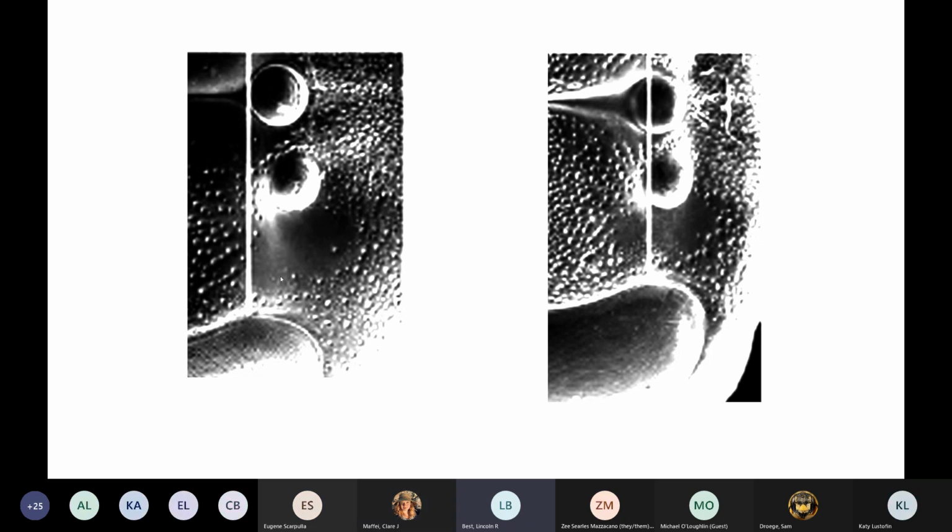Here on the left, we have Bombus. On the right, we have Bombus. And you can see that this is 2 of its own diameters. And not only is it 2 of its own diameters, when you look at this Bombus's lateral ocelli, they just look small. And when you look at a Bombus rufocinctus lateral ocellus, it just looks larger. And so after you look at 10 or 20,000 of these, it just jumps out at you. But otherwise, you can see that it is about 1.5 lateral ocelli diameters to the eye margin here, and about 2 here. And we'll take a look at some of those, and I'll point that out in some specimens shortly.